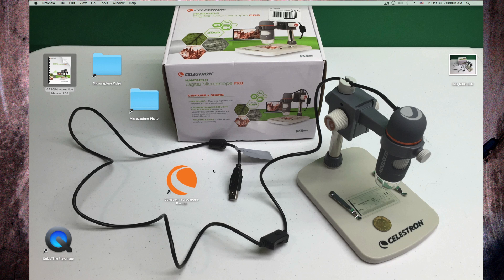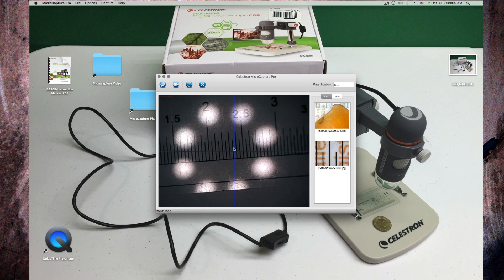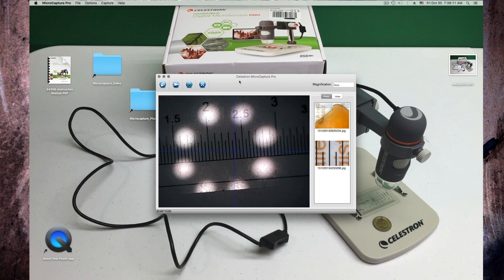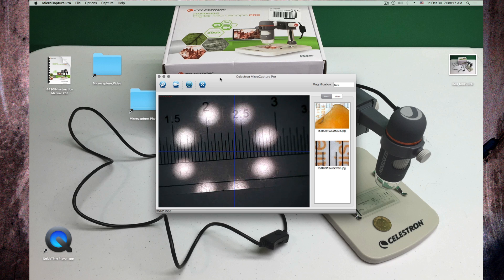Let's start this thing up here. You see, I can't move after I open it, the window. I noticed that, so it takes a long time for the software to react.